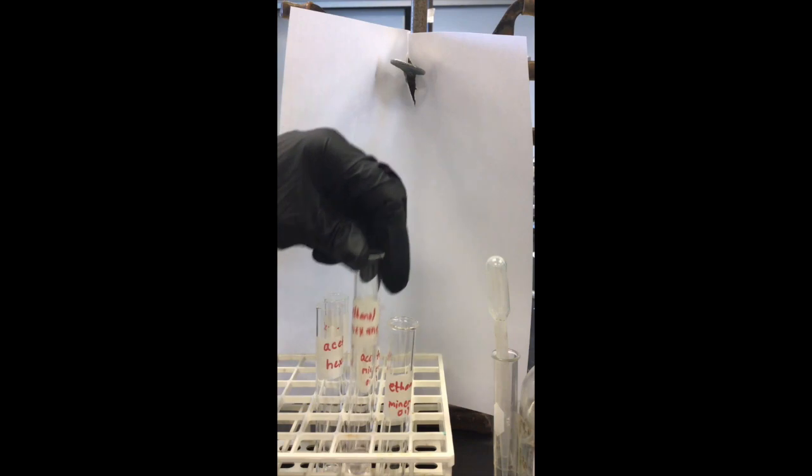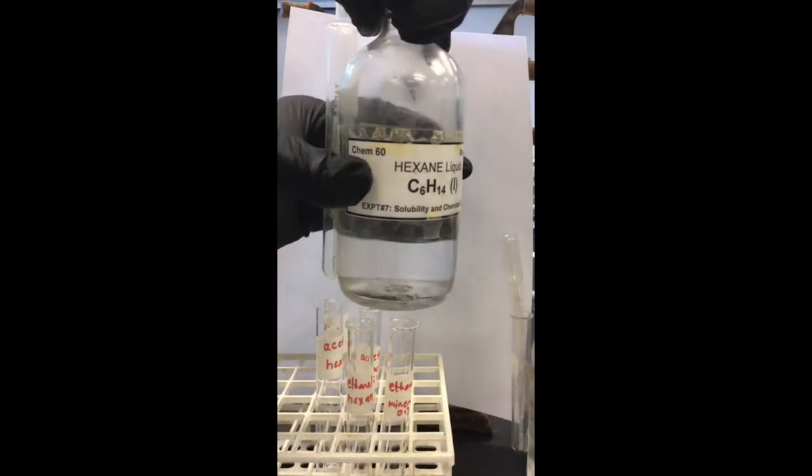Next we have ethanol and hexane. So the ethanol again is already weighed out there. I'm putting hexane in with this one.